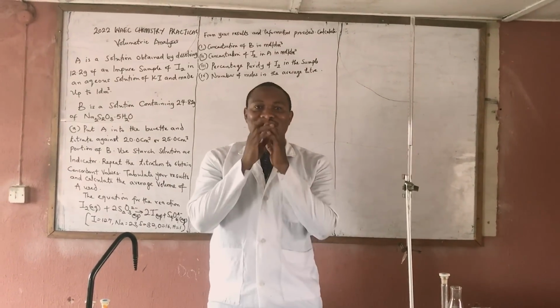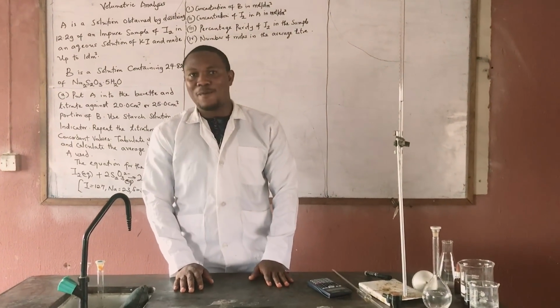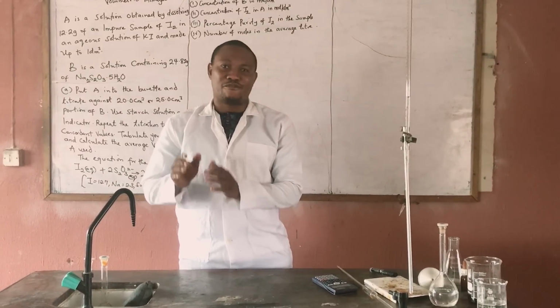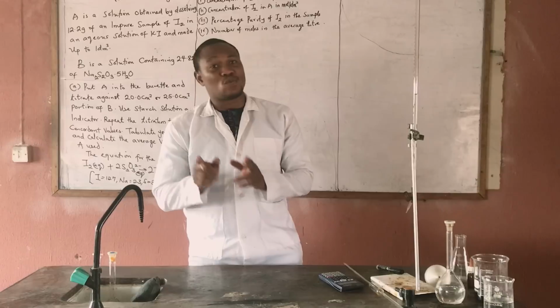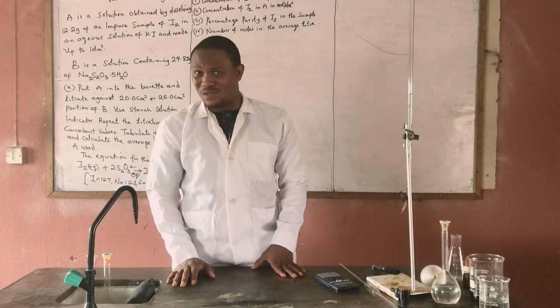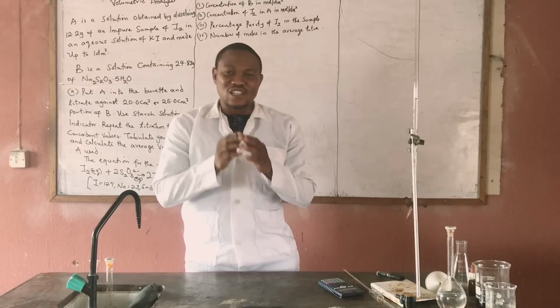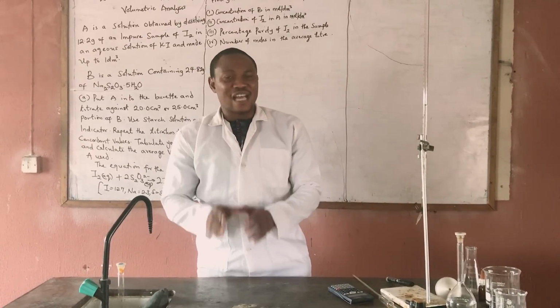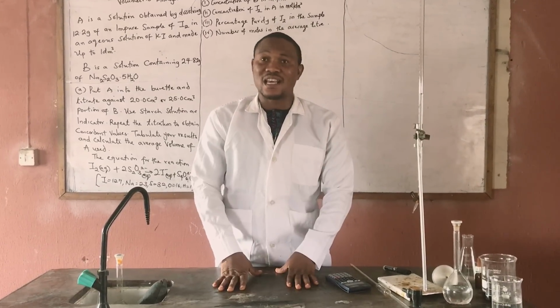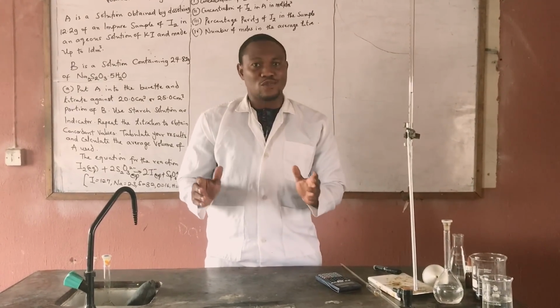Yes, the long-awaited volumetric analysis for this year's WAEC practical is what I'm going to be doing, and I'll be giving out some salient information. I'll be doing that in 2 segments. I will give students some very vital information, and please, I persuade you, follow those instructions strictly. Another set of instructions will be for my fellow chemists or chemistry teachers, as the case may be. I'm still going to be giving some tips about how the practical is going to look.